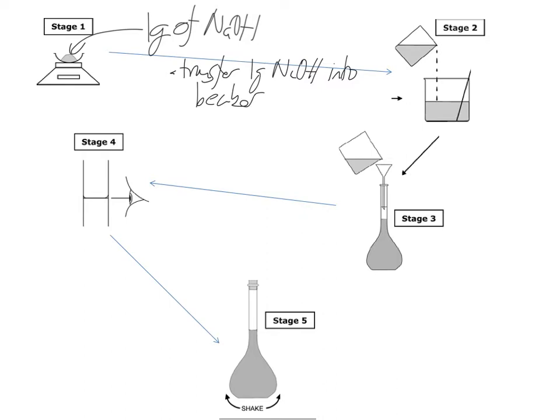And what are we going to do with it in a beaker? Well, we're going to dissolve it. And dissolve in, well, we need to decide how much water we're going to dissolve it into. Let's say maybe 50 centimetre cubed of water. So here's our beaker, and here you can see is our glass rod. And we're tipping some water into there, making it up to roughly 50 centimetre cubed, stirring it round, and making sure our sodium hydroxide fully dissolves.